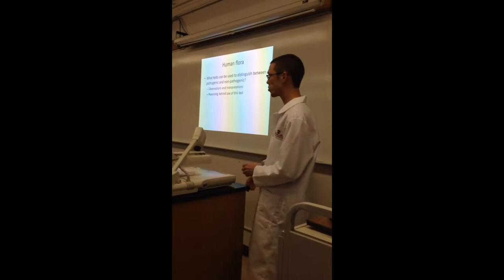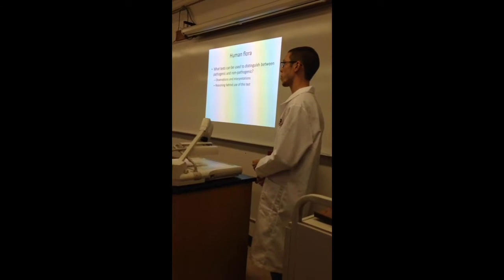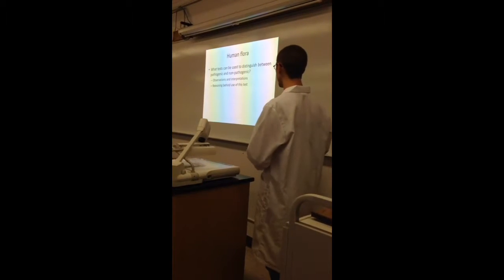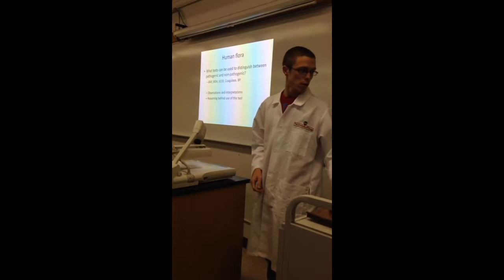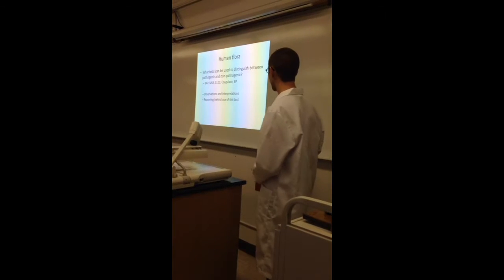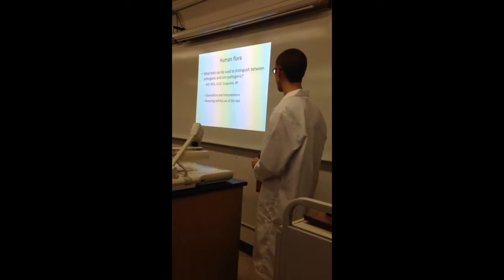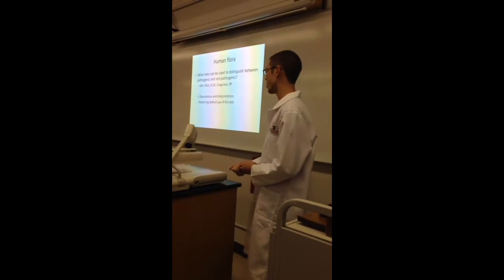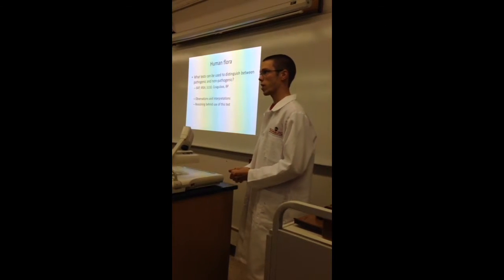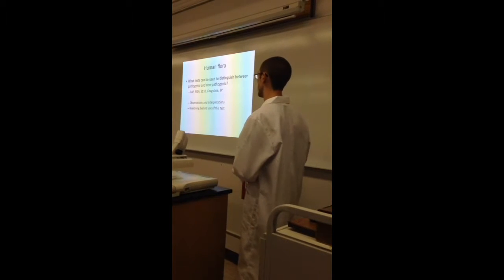Be sure to know the observations and interpretations for the various types of media that you can use to determine whether something is pathogenic or non-pathogenic, and why you're using these tests in the first place. So some of the media that we'll look at is blood agar, MSA, Staph 110, coagulase, and Baird-Parker, and I'll leave you guys to figure out what observations and interpretations relate to the pathogenic versus the non-pathogenic, and why we can use each of these tests.